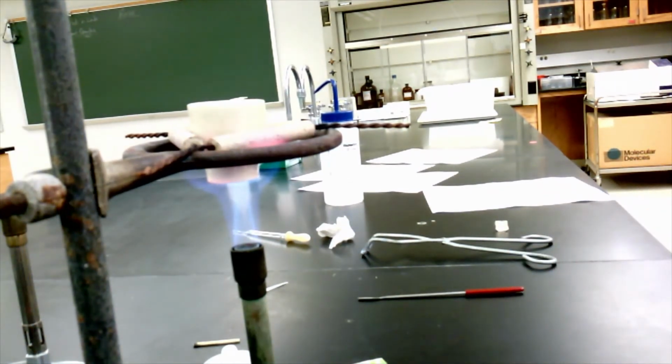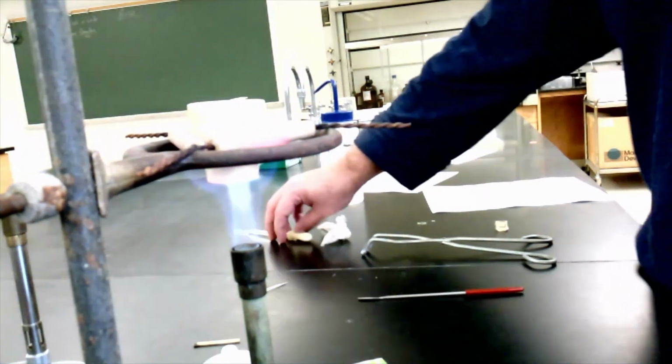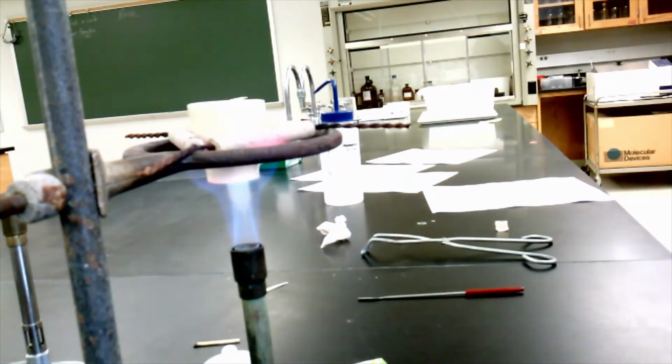So once this is totally done reacting, I'm going to heat this for like 5 minutes, and once it's done, I'm going to let it cool for a little bit, and then add a few drops of water. Okay, now why do I need to let it cool? What happens if I take my dropper, and this is still super hot, and I put some water straight in there? Okay, what do you think is going to happen?